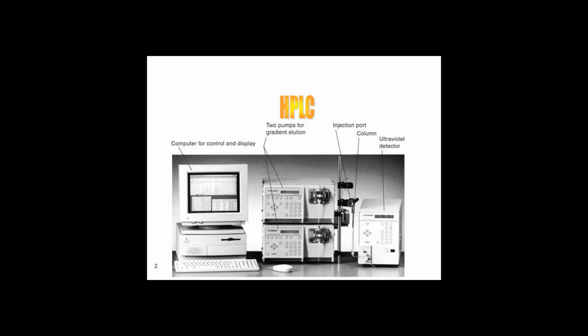Solute ions that are retained on the column can be eluted by changing the solvent conditions, e.g., increasing the ionic strength of the solvent system by increasing the salt concentration of the solution, increasing the column temperature, changing the pH of the solvent, etc.